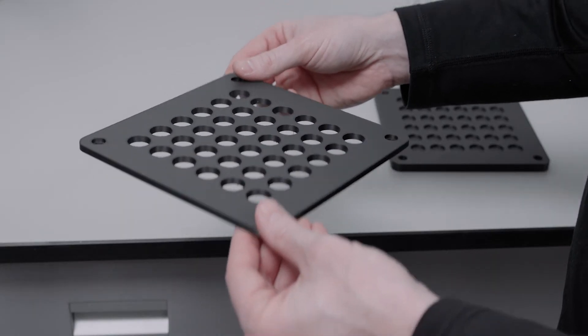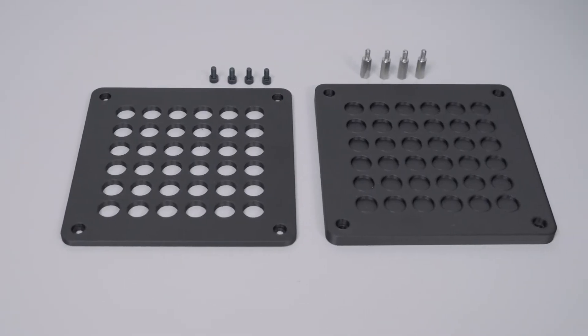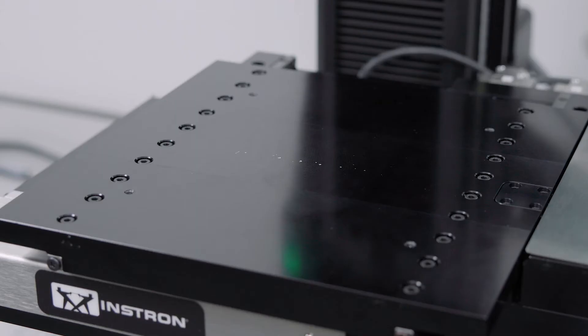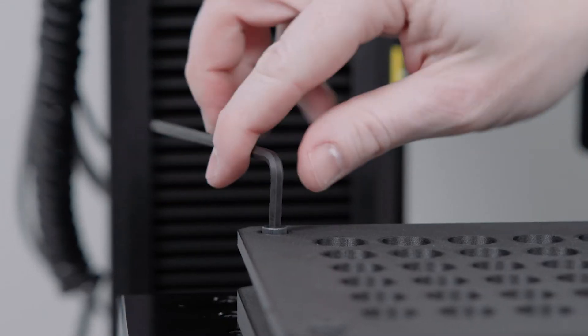In the case of vial testing, we 3D printed a custom fixture that can hold up to 36 vials. This fixture mounts to our automated XY stage.